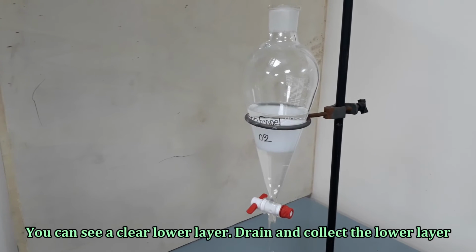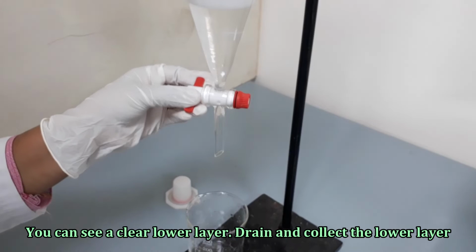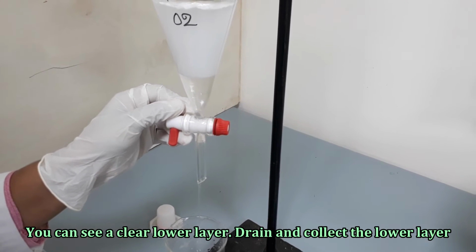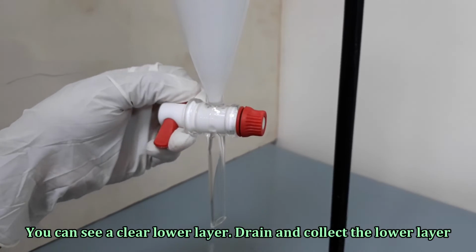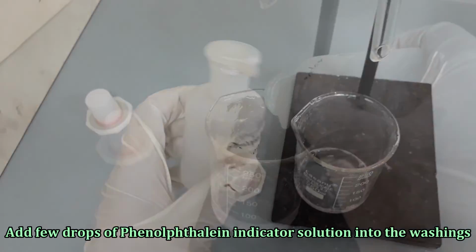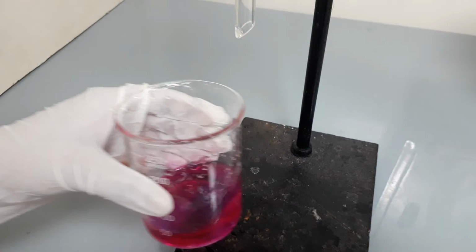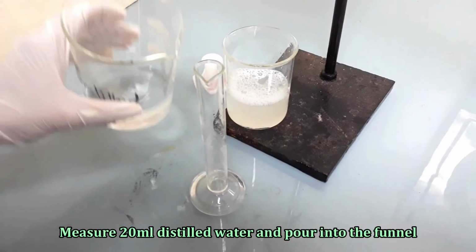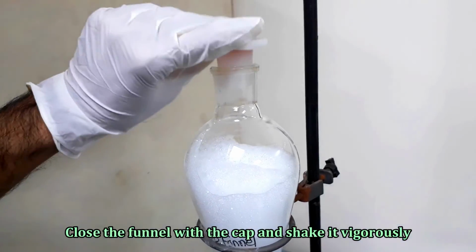If emulsion forms during washing, leave the emulsion in the funnel and proceed with the next washing. Drain the lower layer. Now add a few drops of phenolphthalein indicator solution into the washings. Washings turned deep pink, which indicates the potassium hydroxide is not washed out from the extract completely. So we need to wash the extracts with water until the extracts become free of potassium hydroxide.